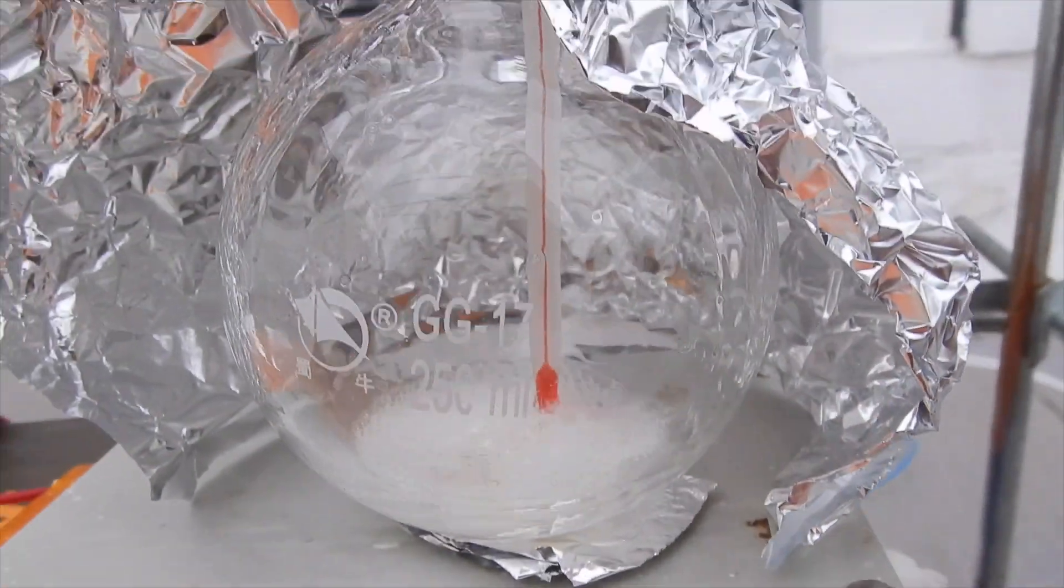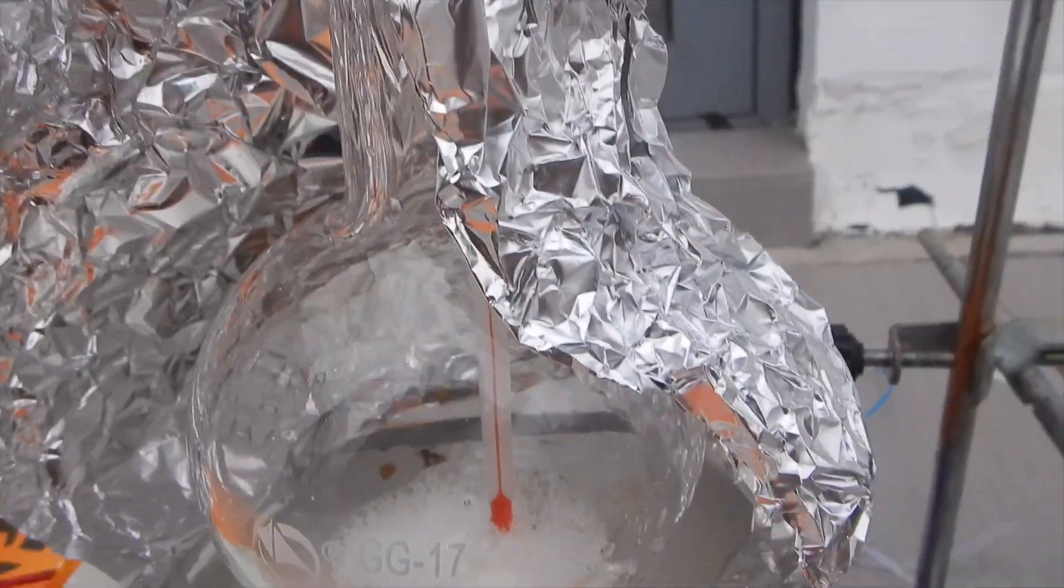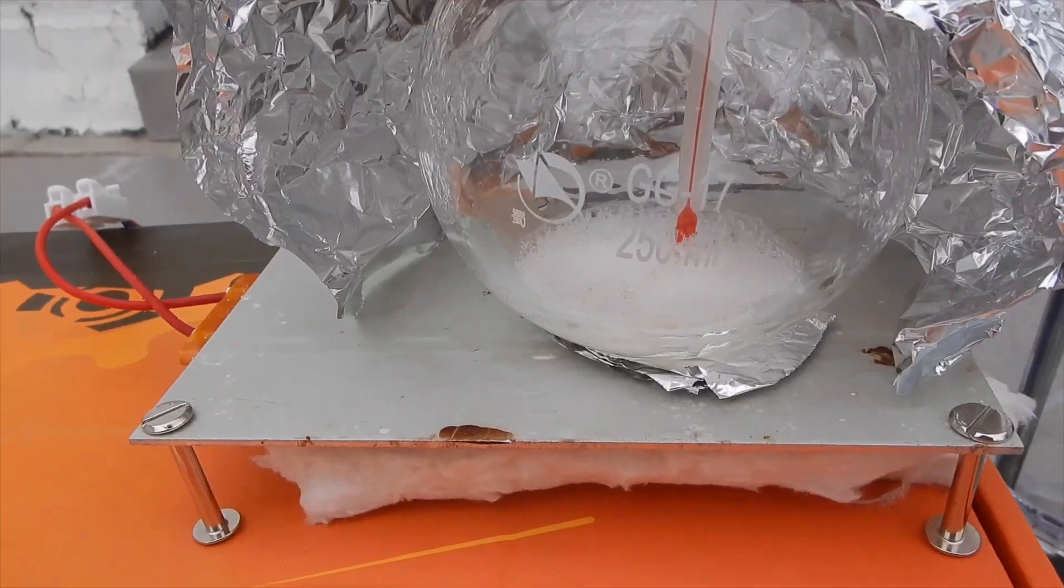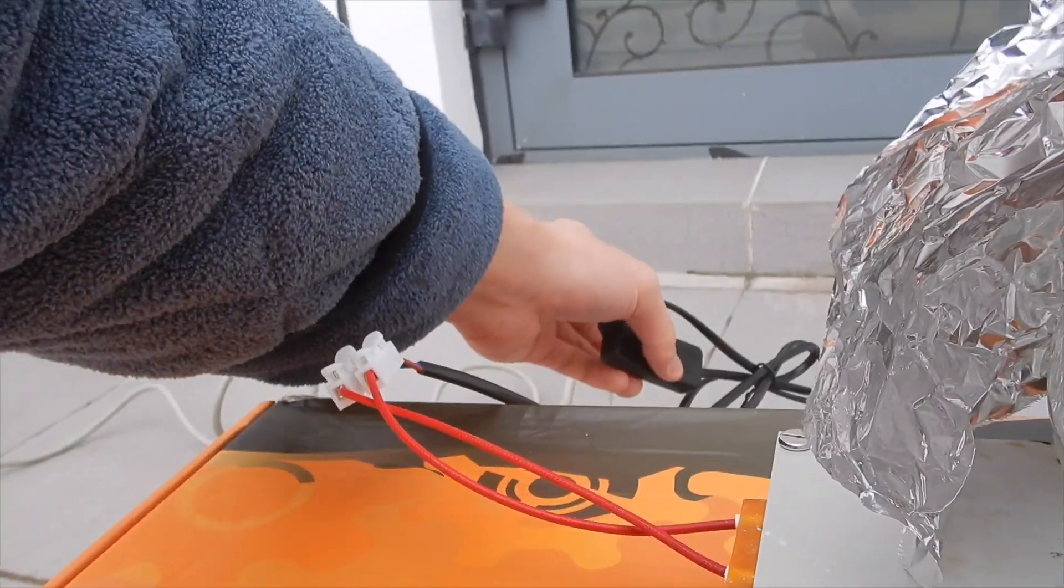I didn't want to continue the distillation, since the ether peroxides, which are not volatile, tend to stay in the residue and possibly explode. Therefore, I turned off the heat and took everything apart.